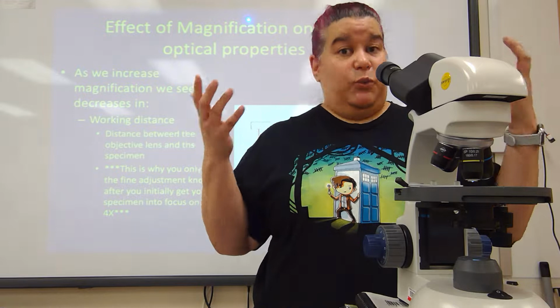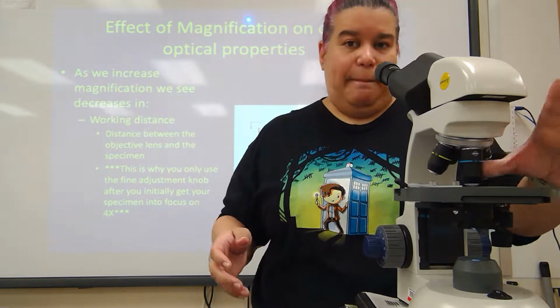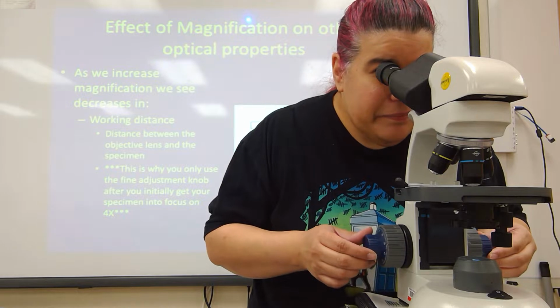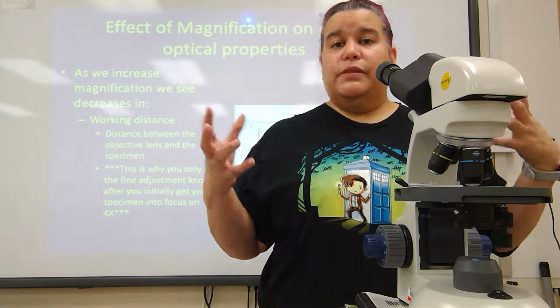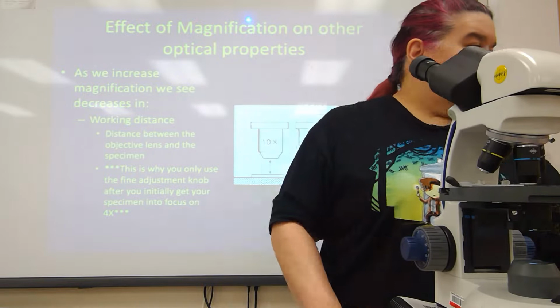Now, again, in a perfect world, I would be. Not in a perfect world. So I'm going to switch to 40. Is it centered? Actually, it is pretty centered. So I'm just going to leave it. But those two terms, that's what we're talking about. Okay?